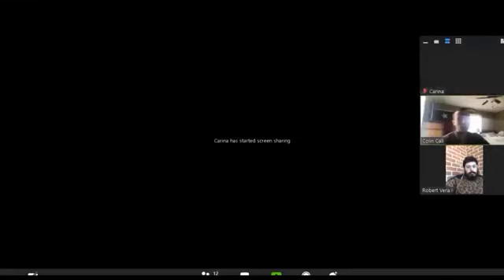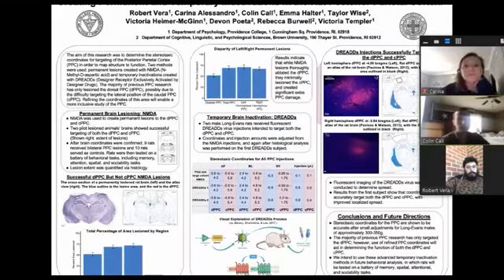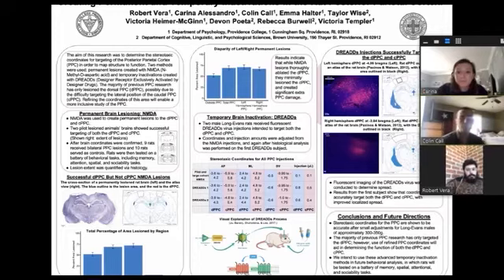We've been using varying amounts from 0.5 mg per kg to 0.1 mg per kg. But besides that, we've been looking at other ways to test these portions of the brain once we've figured out that the CNO is working. And with that, we'll open up to questions.